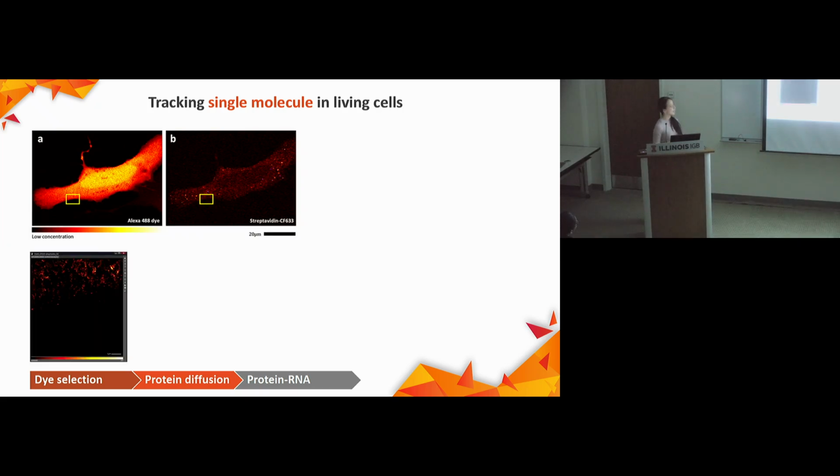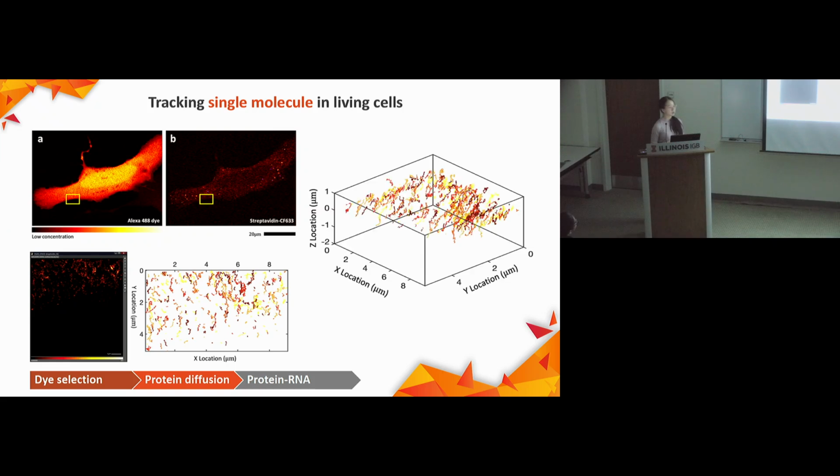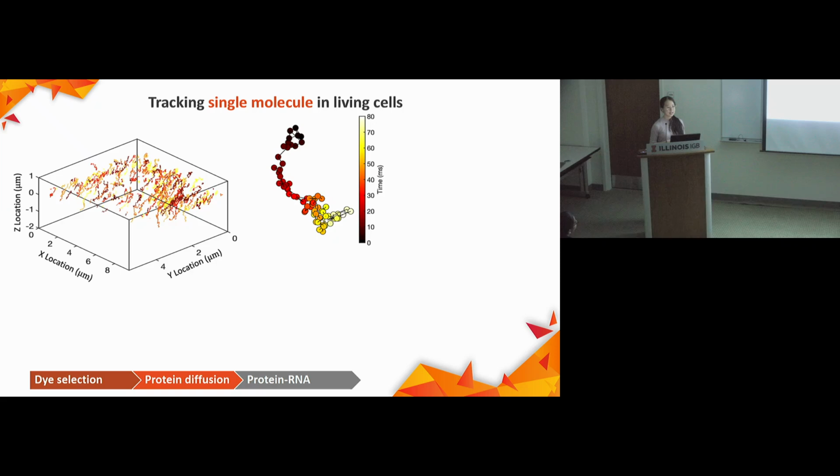And we're getting these traces on MINFLUX. And we can replot this trace in MATLAB, and the trace looks like this. Each individual trace is plotted in a different color. And actually, we're looking at this in 2 dimensions. Actually, this is going to be 3 dimensions. And we can zoom in to each individual trace. It will look like this.